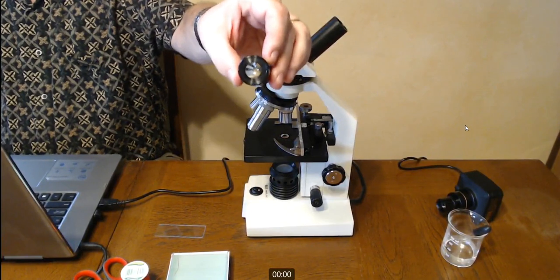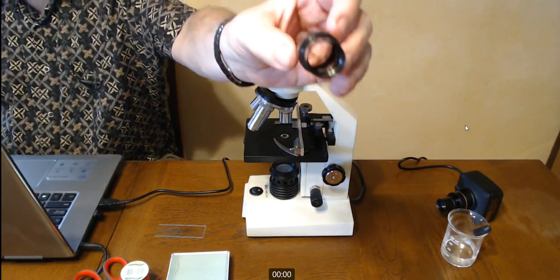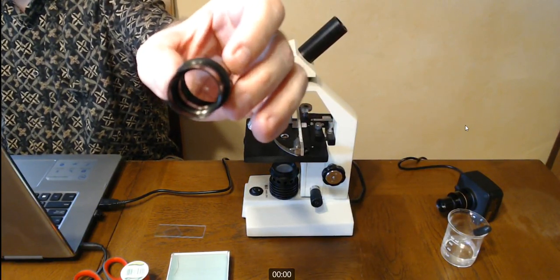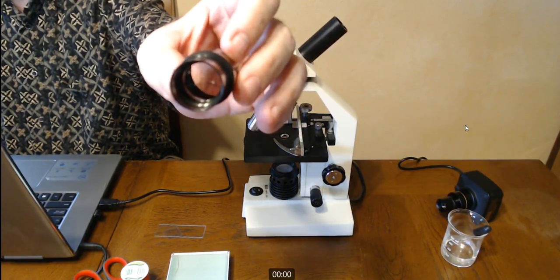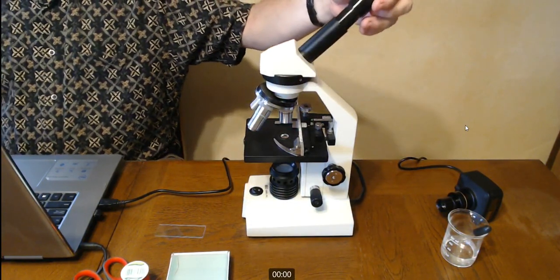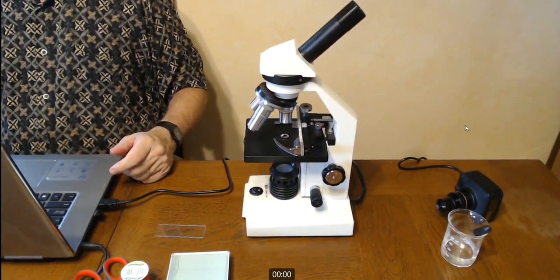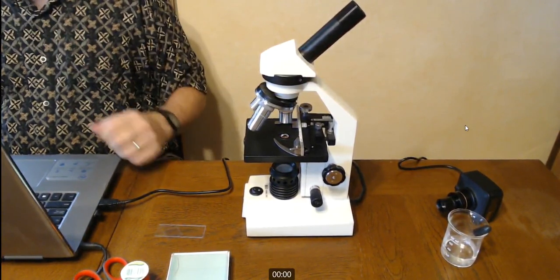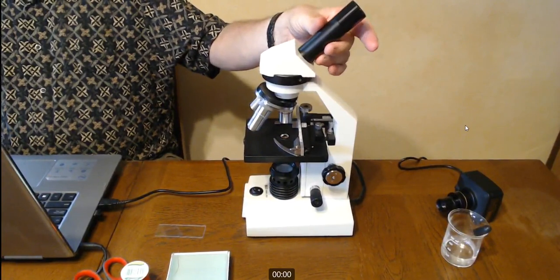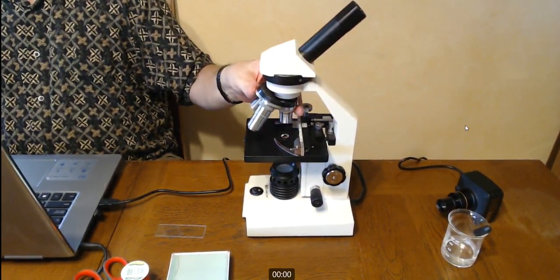So that's the piece you look through. If you look, I wonder if you can see it here, in there you see a little line. That line is a pointer, and that pointer will appear on all your slides when you look through it, so you can use that to point out things to other people. With my camera it will not have the pointer, so we won't see that. So that eyepiece goes into the tube here, the body tube, works its way into the head, into the objectives.